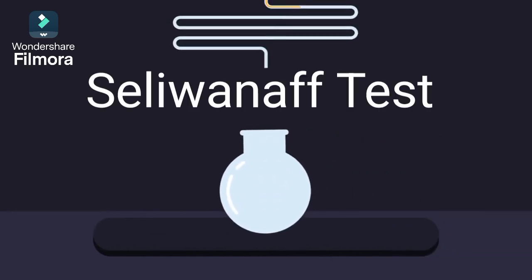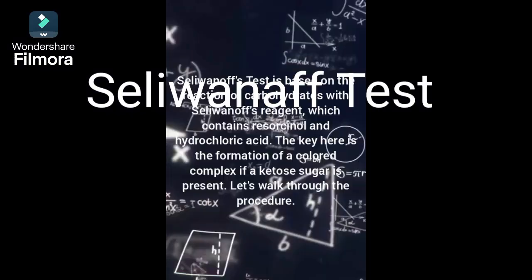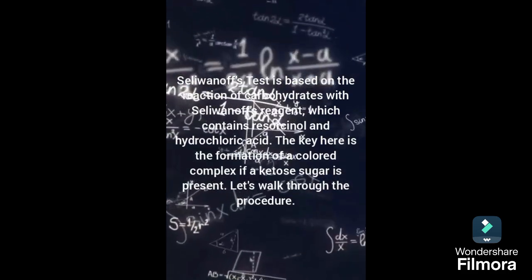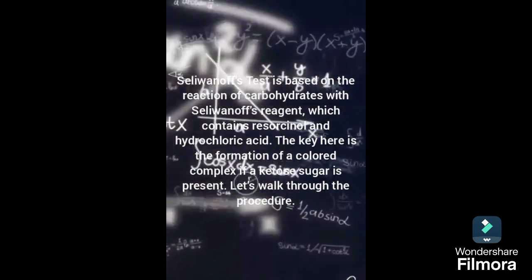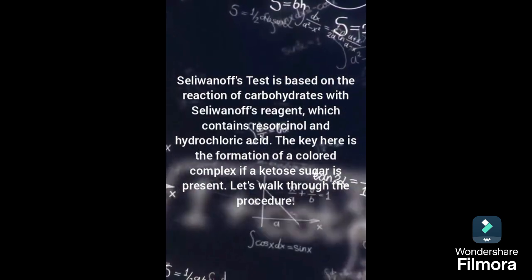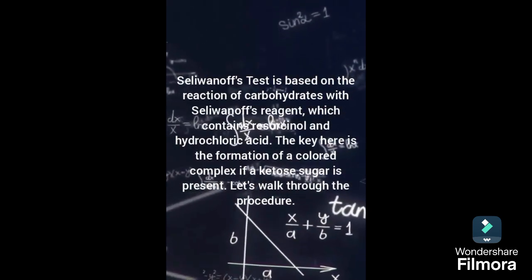This video will be exploring Seliwanoff's test. Seliwanoff's test is based on the reaction of carbohydrates with Seliwanoff's reagent, which contains resorcinol and hydrochloric acid. The key here is the formation of a colored complex if a ketose sugar is present. Let's walk through the procedure.